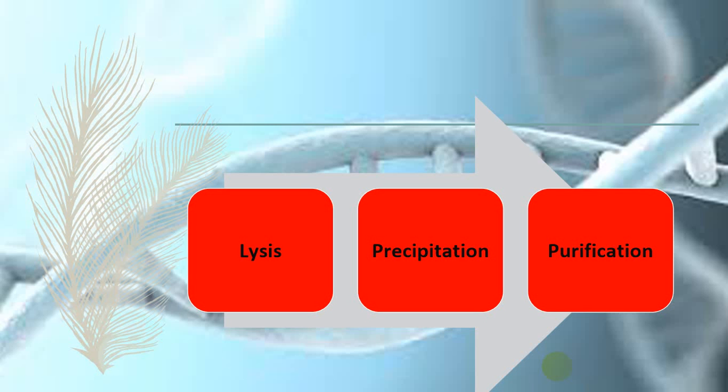So in the first step we have to grind or crush the tissue by different mechanical methods. In case of plant cells, as you can see in the video, we were using a grinder type of thing in the test tube. First we added liquid nitrogen to freeze the cell, which made the cell able to break down easily and made the tissue into pieces, and it was easy for us to extract the DNA from the cell.